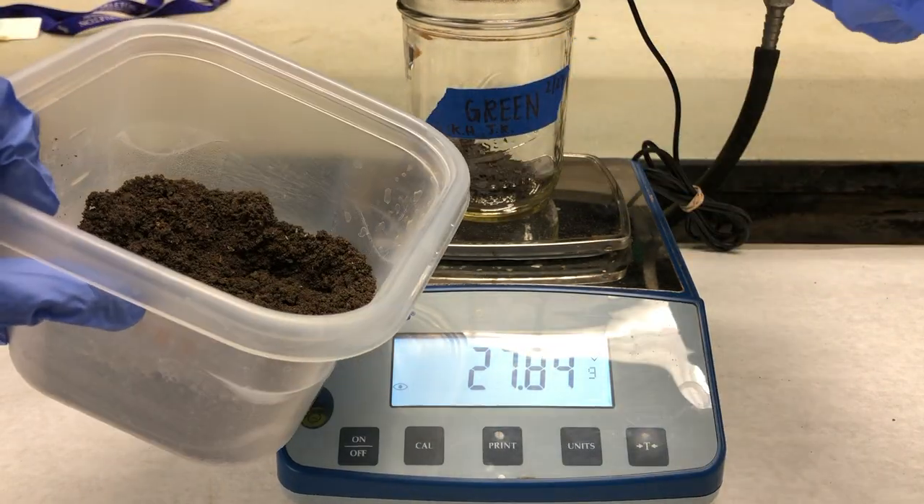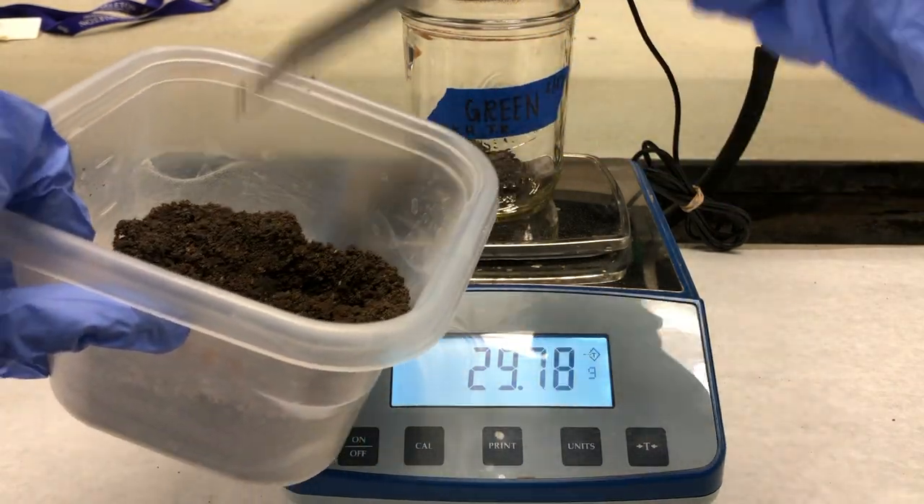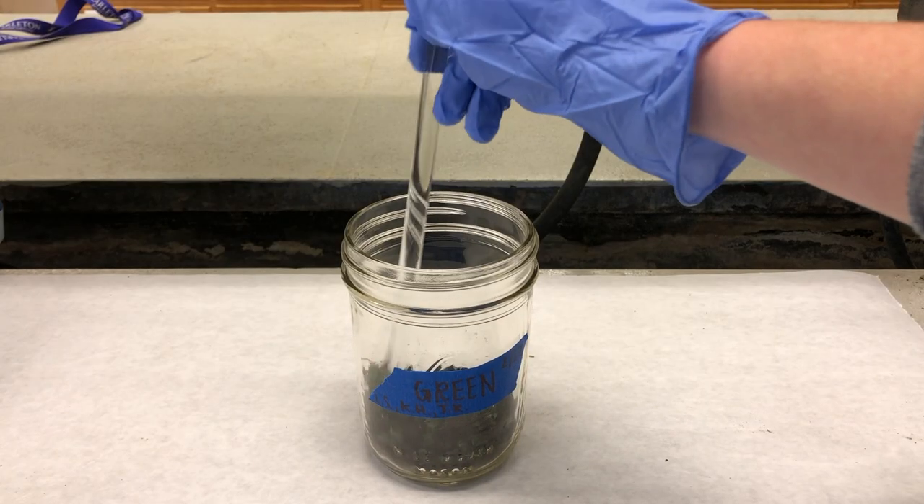To the brown and green treatment jars, add 0.6 grams of the respective residues after finely grinding the residues with a small mortar and pestle. Mix the residues into the soil using a stirring rod.